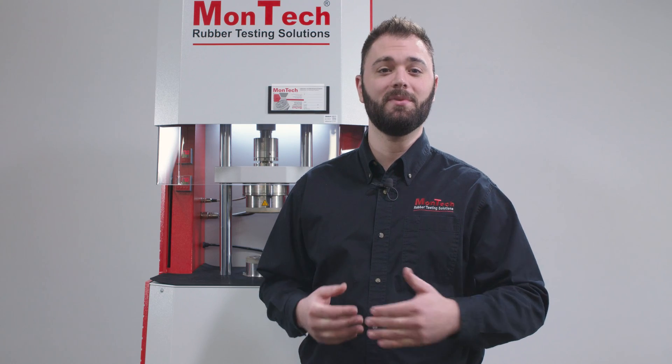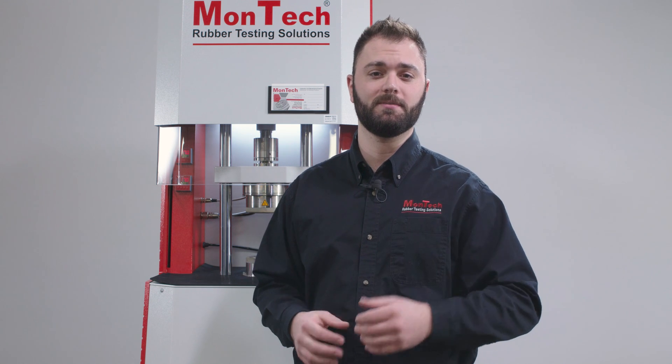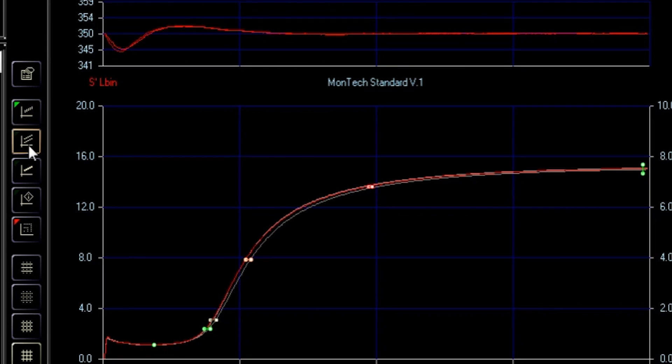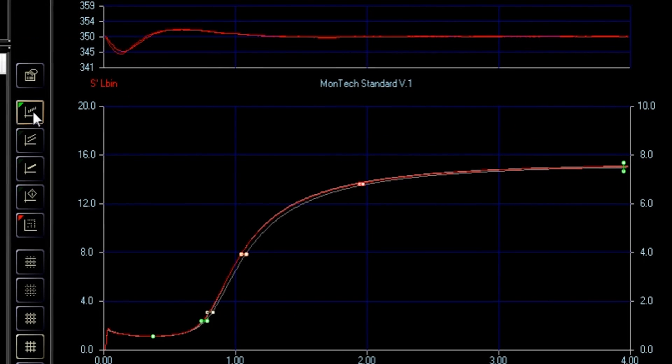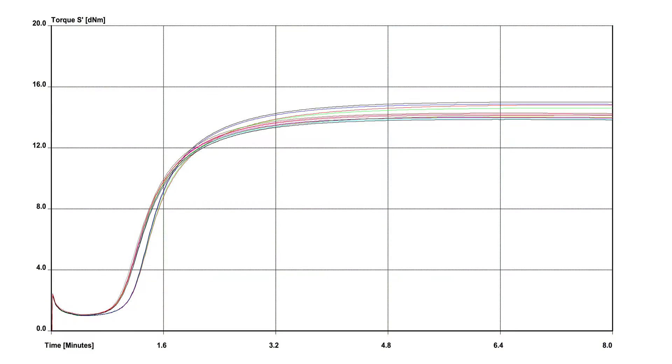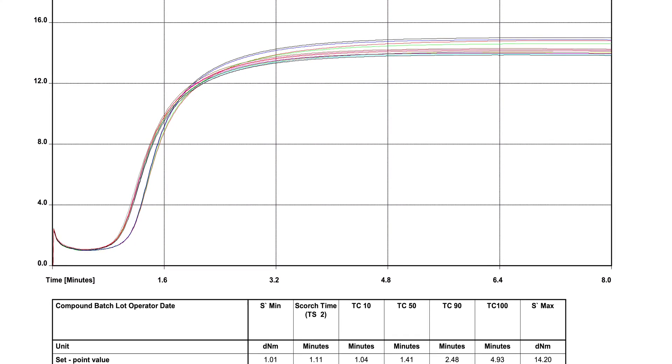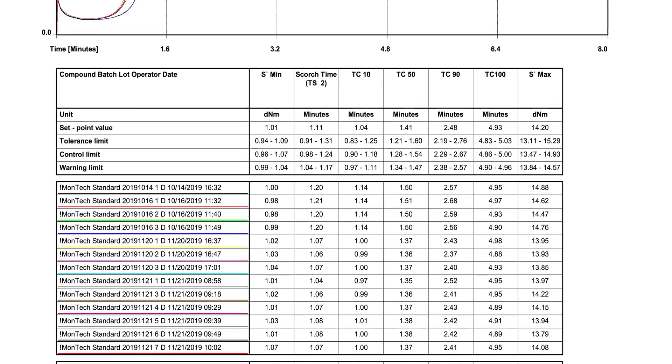These data points can be used in quality management to ensure compounds are within the limits of production specifications. Gates can be set up in MonControl's test parameters to automatically determine if a material has passed or failed meeting the thresholds required for production. Furthermore, statistics from multiple tests can be examined at once to look at uniformity and data distribution among different batches of material.